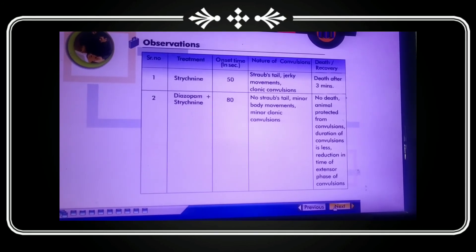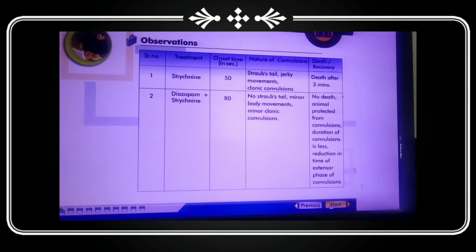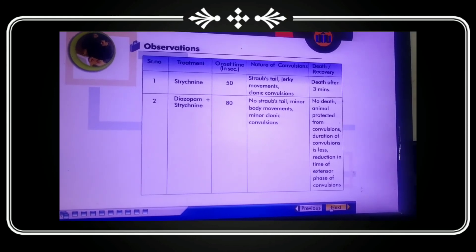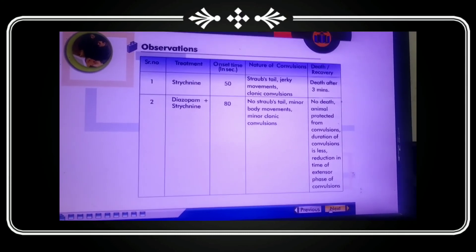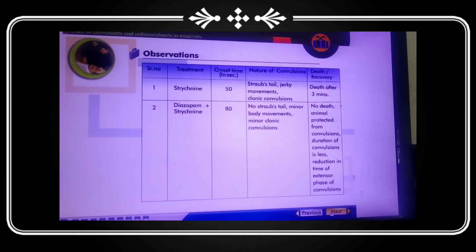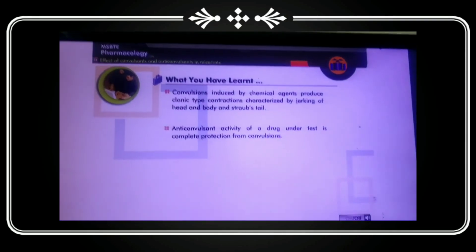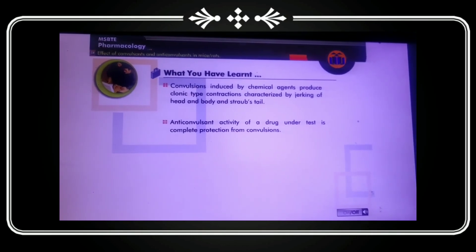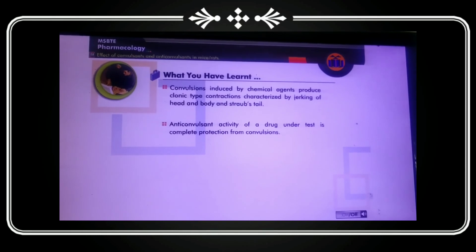Protection from convulsions and reduction in duration of convulsions is noted, along with reduction in the tonic extensor phase. With strychnine, convulsions are produced; with diazepam administered alongside, Straub's tail is not shown, body movements are minimal. Convulsions induced by chemical agents produce clonic-type contractions characterized by jerking of the head and body and Straub's tail. Anti-convulsant activity of a drug is measured by complete protection from convulsions. Thank you all for inspiring me to make this video.